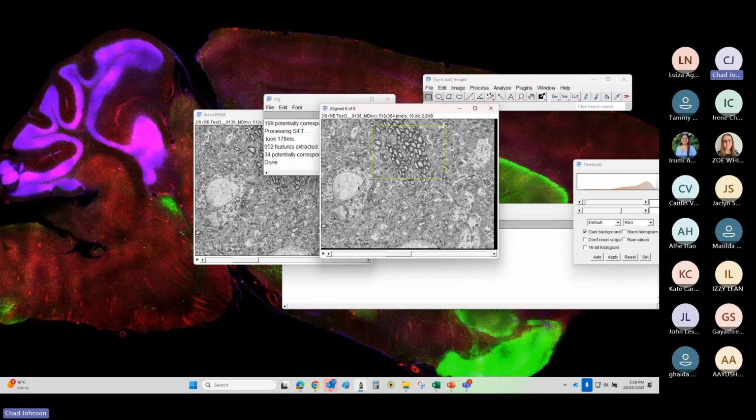So then you can sort of grab a section. I'm going to duplicate that, and that gives me a more aligned image. Now I could try the other functions like affine and things like that, but I don't think it would be necessary. That's pretty much good enough.